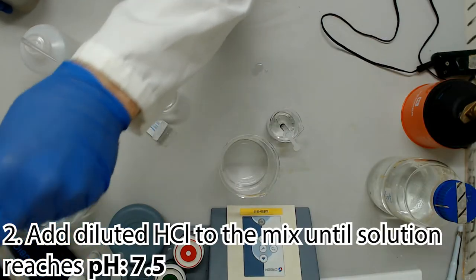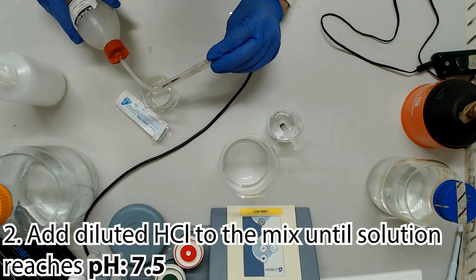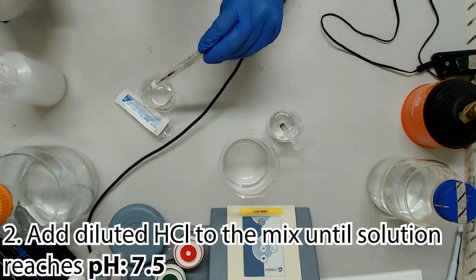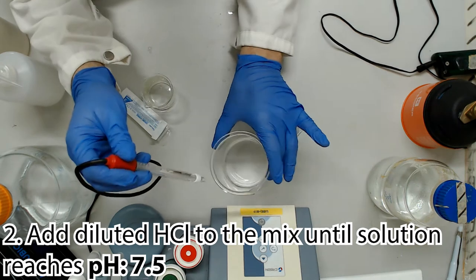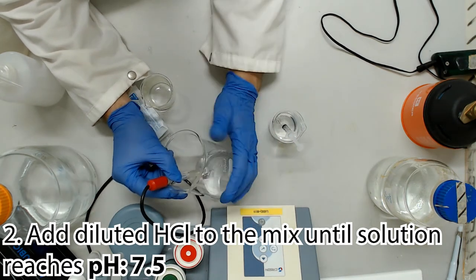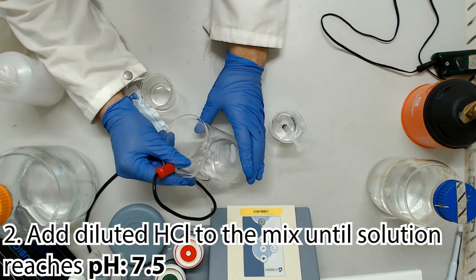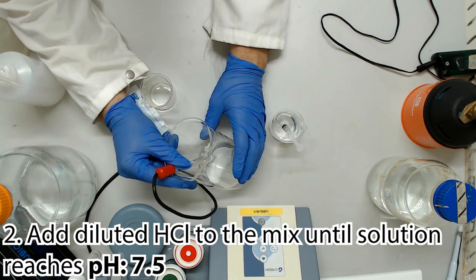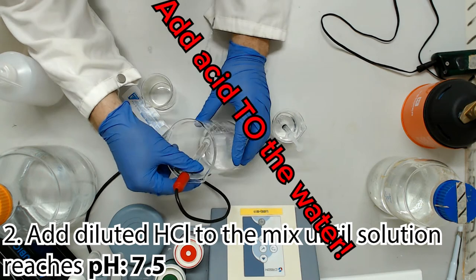We'll next adjust the pH down to 7.5 using diluted hydrochloric acid, adding a tiny bit of Trisbase if we overshoot. I know I'm starting to probably sound like a broken record player to those following along the series in order, but if this is the first video you're watching from us, let me throw in a gentle reminder about diluting your hydrochloric acid. Add the acid to the water.